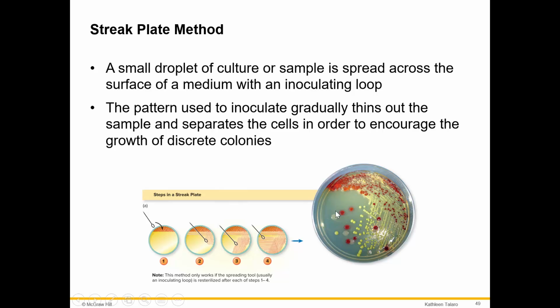The reason for isolating colonies is so that we can identify the species within a mixed culture. If we see a mixed culture has hundreds of one type of bacteria and then a few of other types of bacteria, the one that's usually the pathogen is going to be the one that's most numerous, or it's going to be the one that causes things like beta hemolysis, really bad hemolysis.